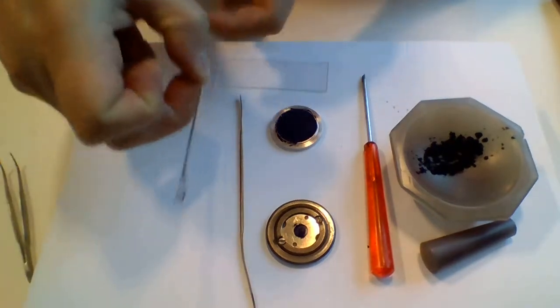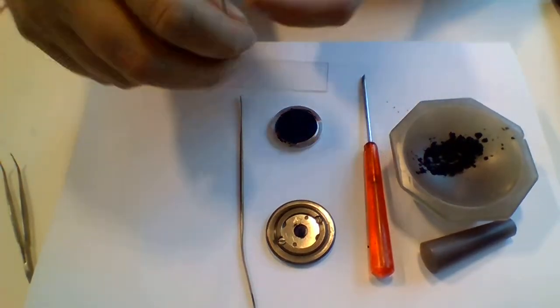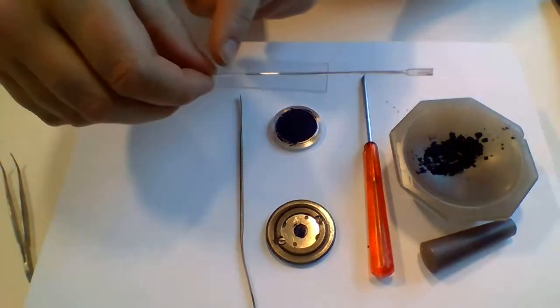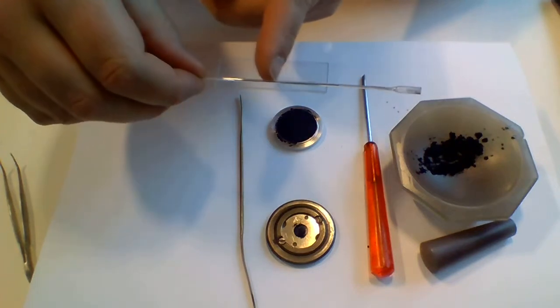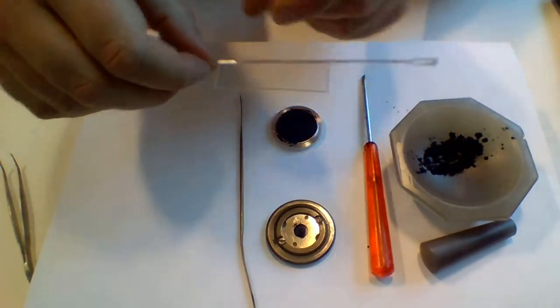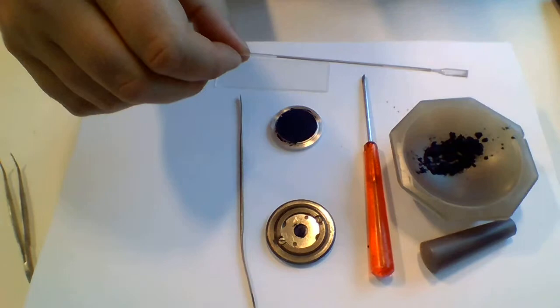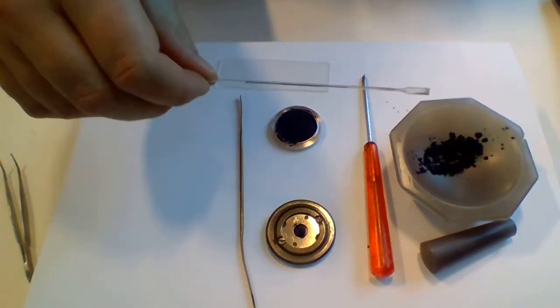Finally, all instruments can also run in capillary setup. In the capillary, we can mount a very small amount of sample, or have just a little bit of sample, and still conduct a diffraction experiment.